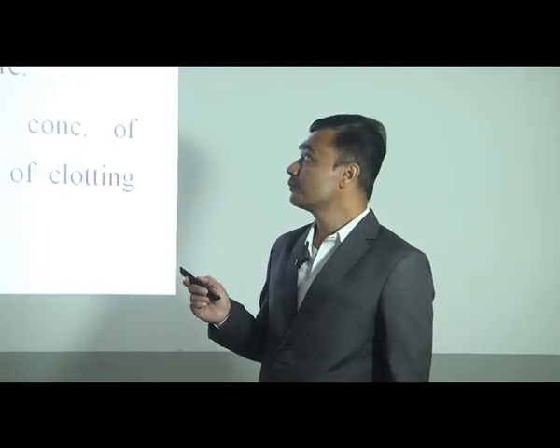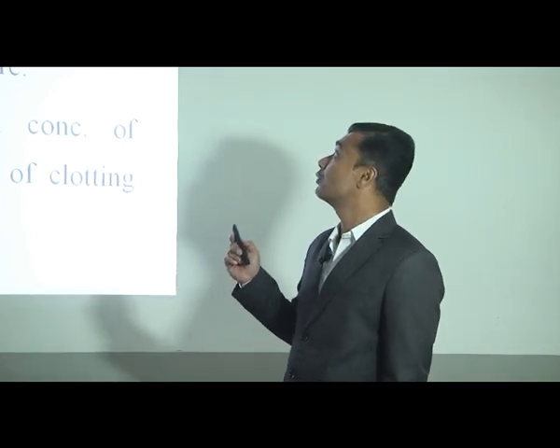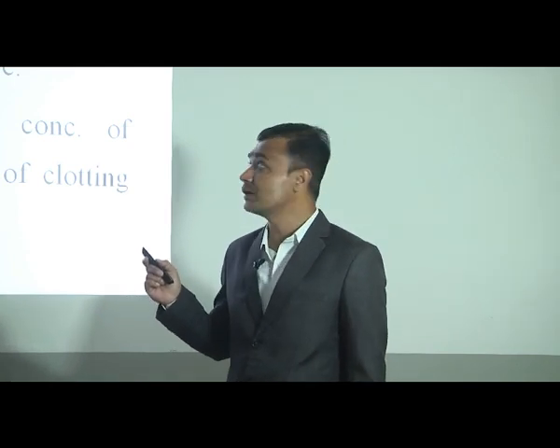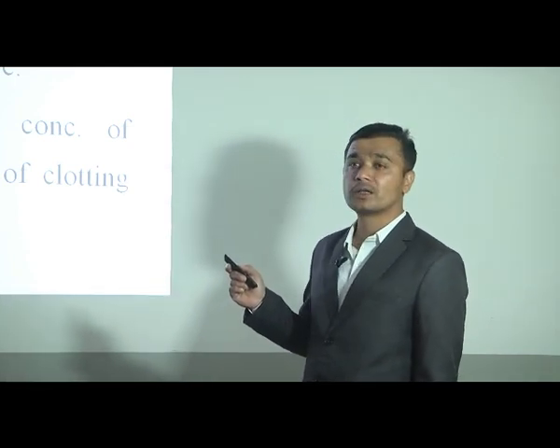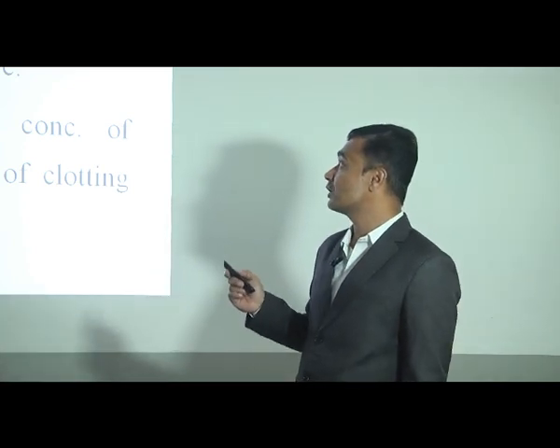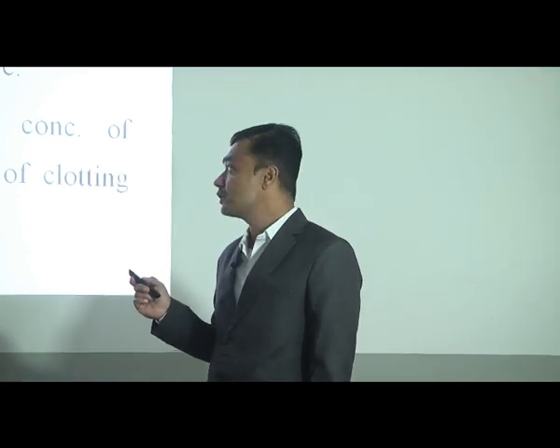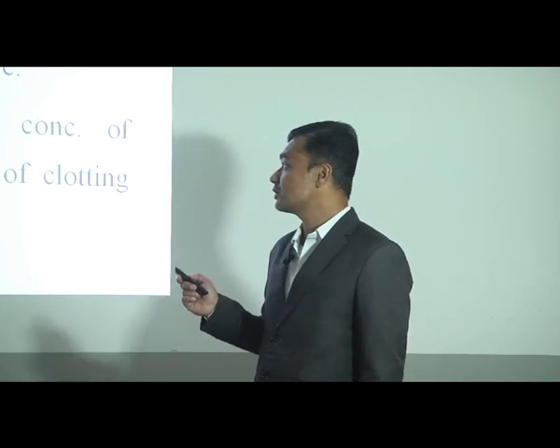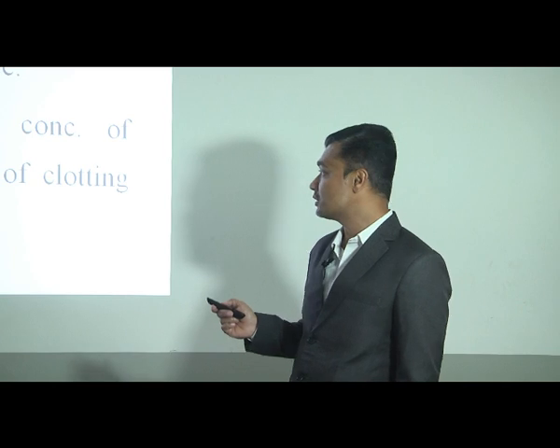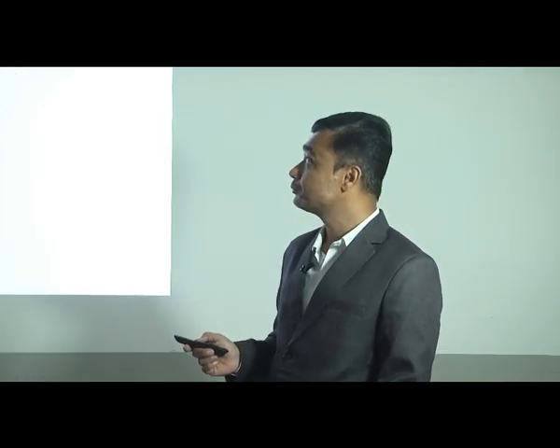So this is the procedure. In that, the preparation or test sample is added to the lysate. 0.1 ml test sample and 0.1 ml LAL reagent, Limulus amoebocyte lysate reagent. Incubate for 1 hour at 37 degrees Celsius and the mixture is analyzed. The result of the reaction is turbidity, precipitation or gel formation of the mixture if pyrogens are present. The rate of reaction also depends on the concentration of endotoxins, that is pyrogens, pH, temperature and the presence of clotting enzymes and proteins in the lysate.